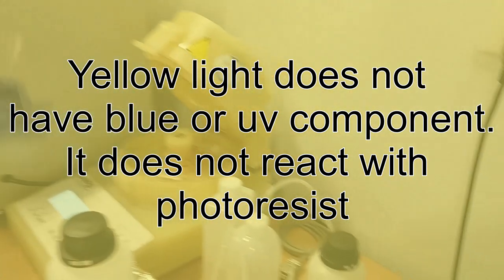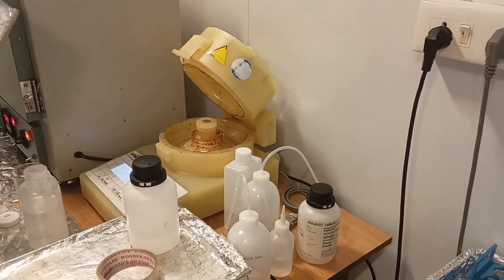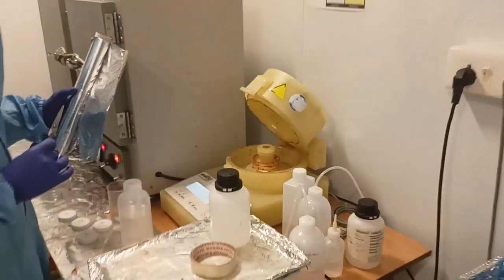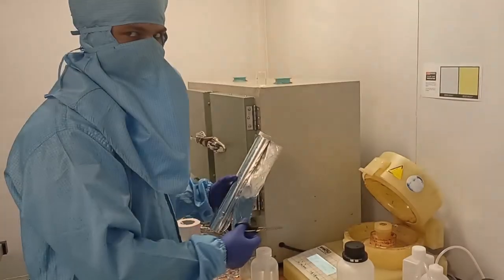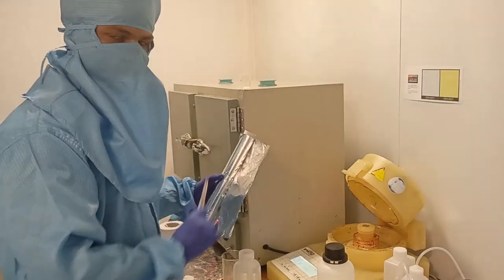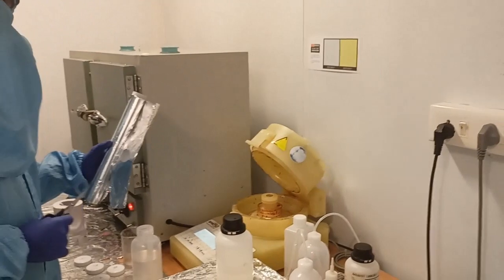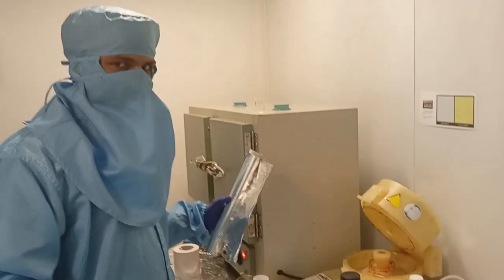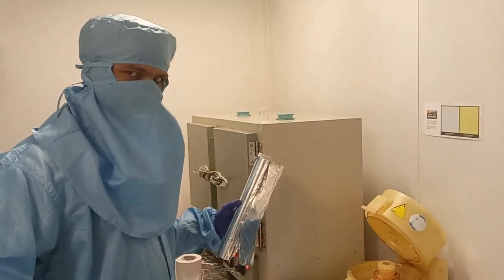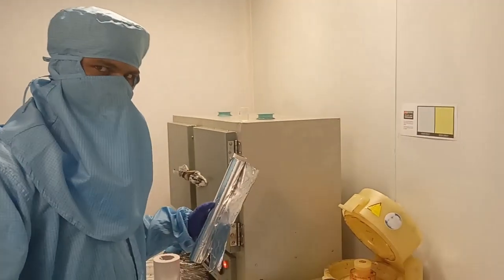What is this thing? This is a spin coater, a digital spin coater. So we can set the angular spin coating speed as per our convenience, though it has to be optimized. It basically defines the thickness of the film, the photoresist thickness. Because if you increase the spin coating speed, the layer thickness will be less, because most of your photoresist will be spread out of the substrate surface.